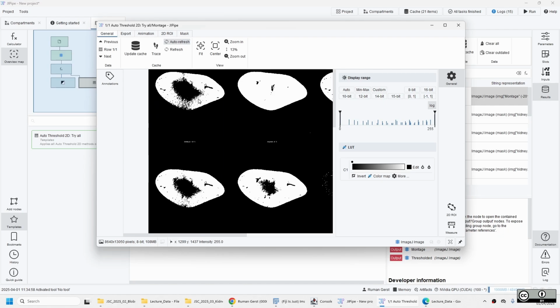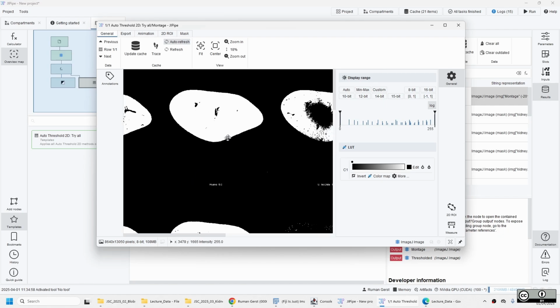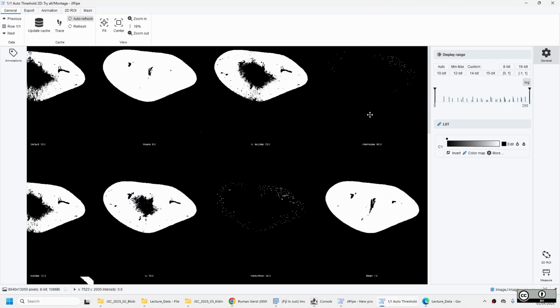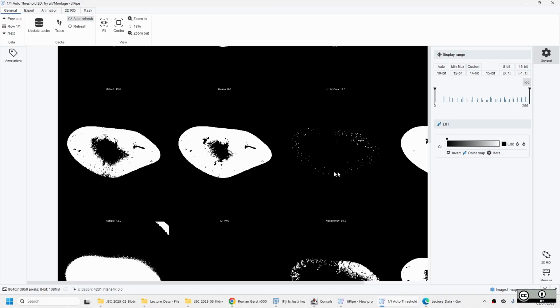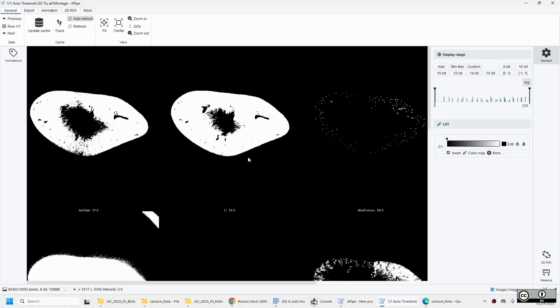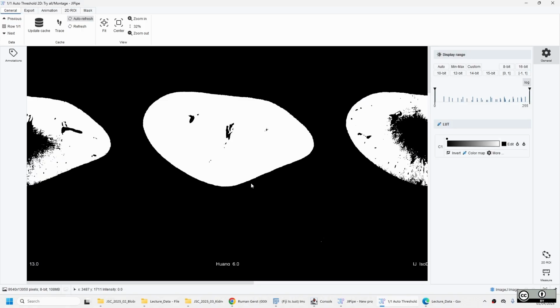And then you see here, just like an image, you can easily compare how well each thresholding algorithm behaves. Let's make it larger. So you see here some of these, they react more to the glomeruli. Some are very good for the tissue, or seem to be good for the tissue. If you are familiar with the ImageJ thresholding methods, usually the Huang threshold is very good if you have something that is quite faint, because it reacts very, very strongly towards objects.